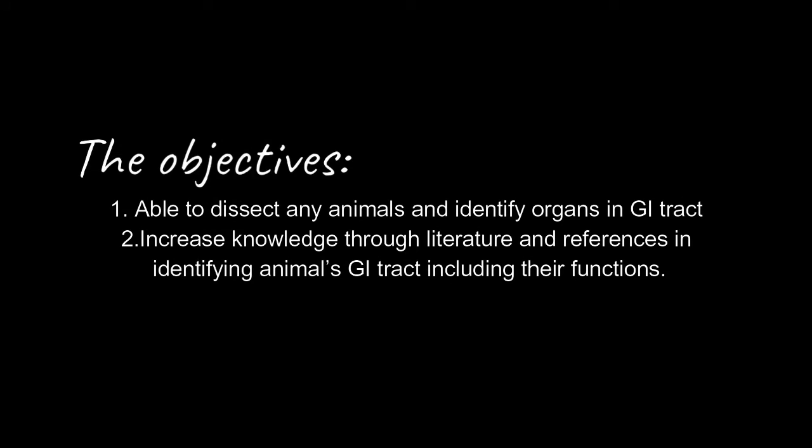The objective. Number 1, to be able to dissect any animals and identify organs in the G-tract. Number 2, to increase knowledge through the literature and references in identifying animals' G-tract, including their function.